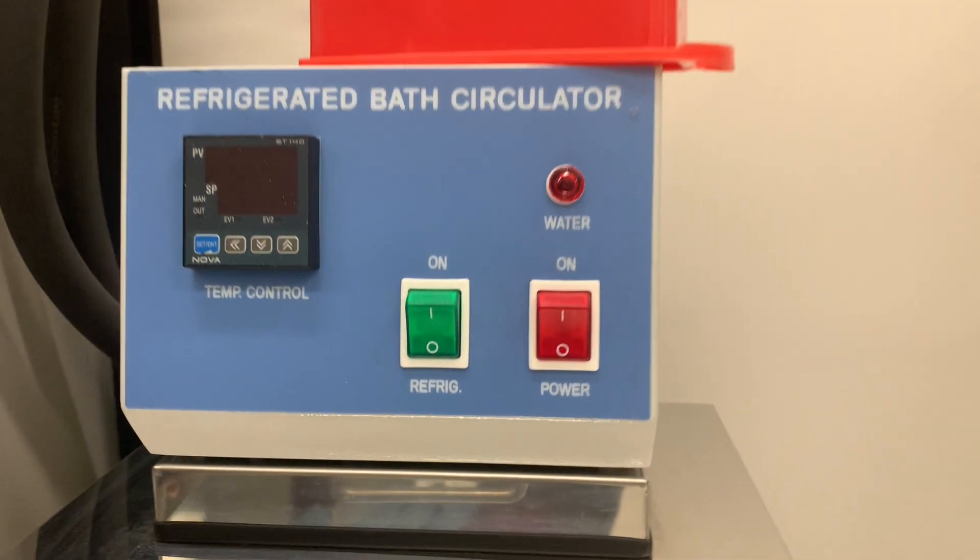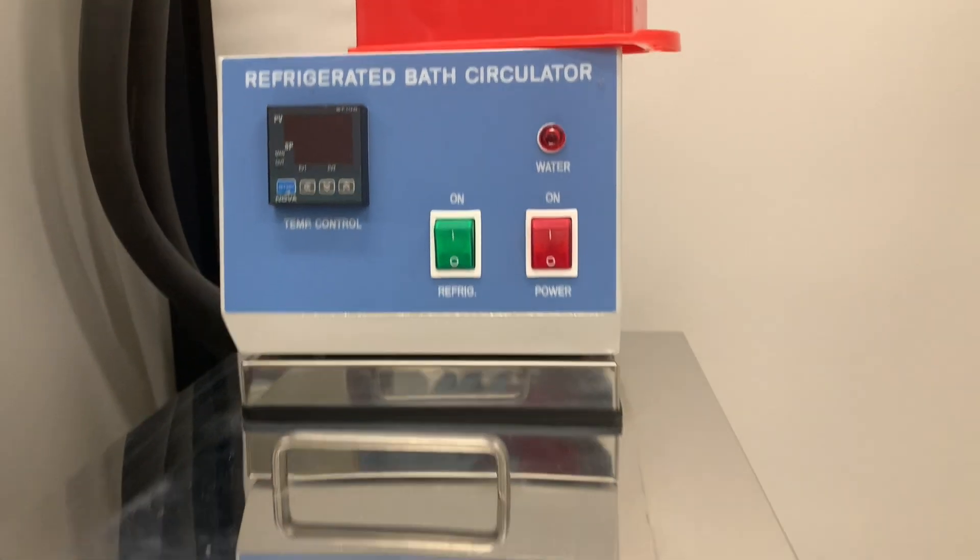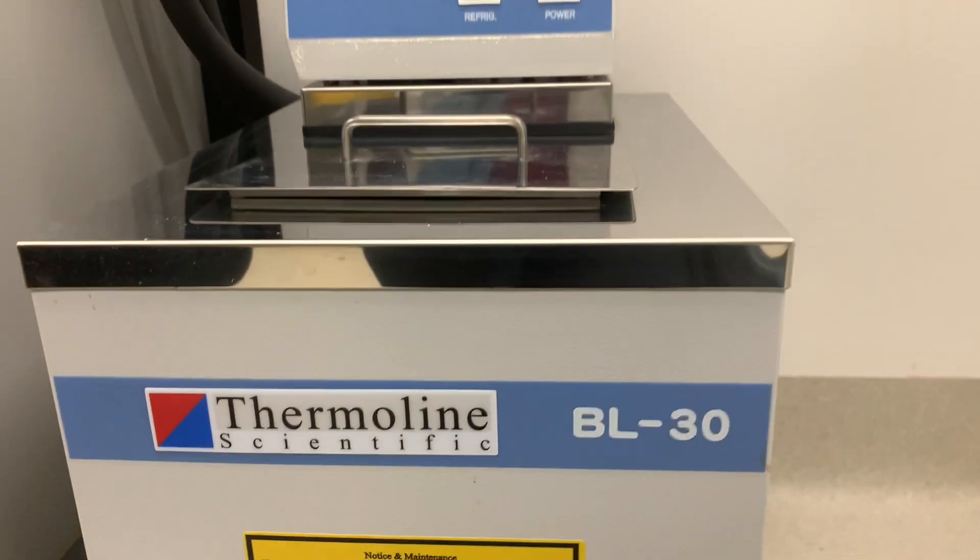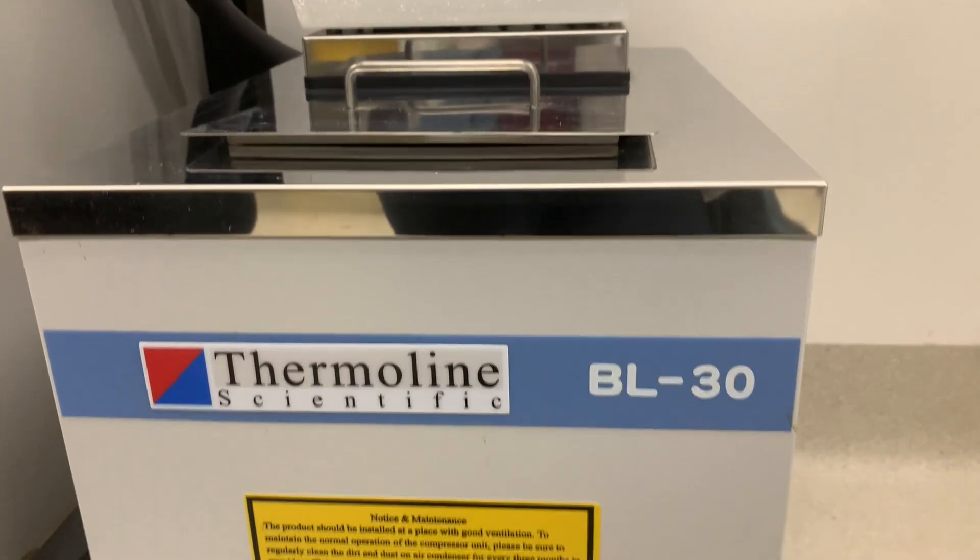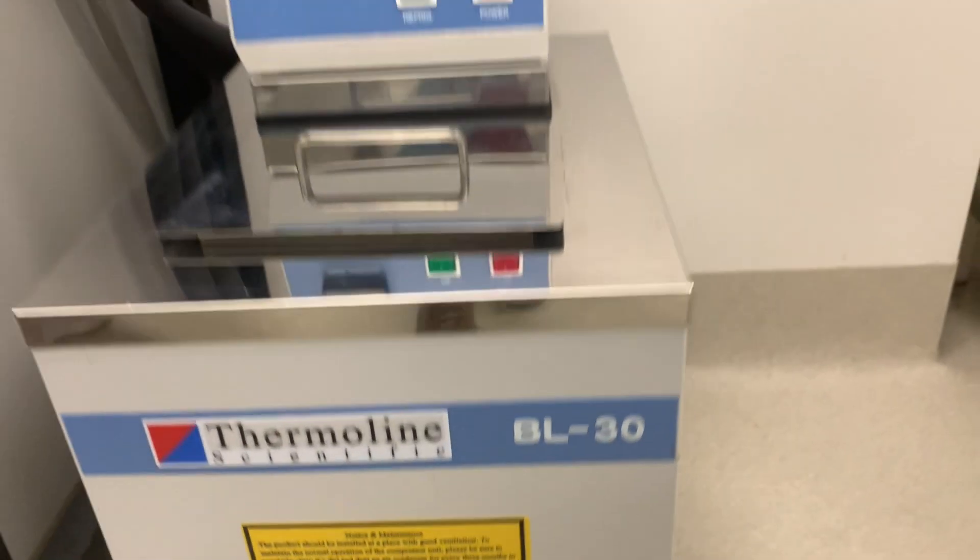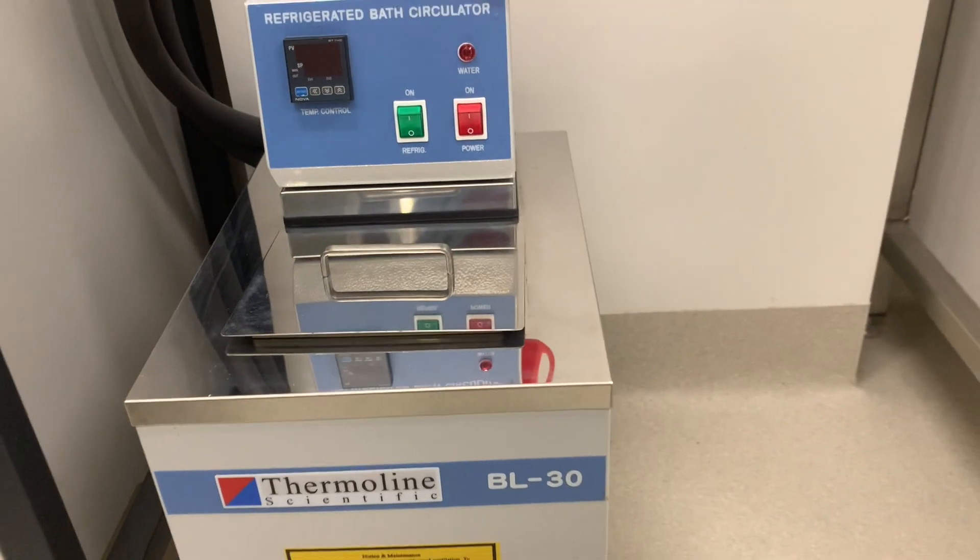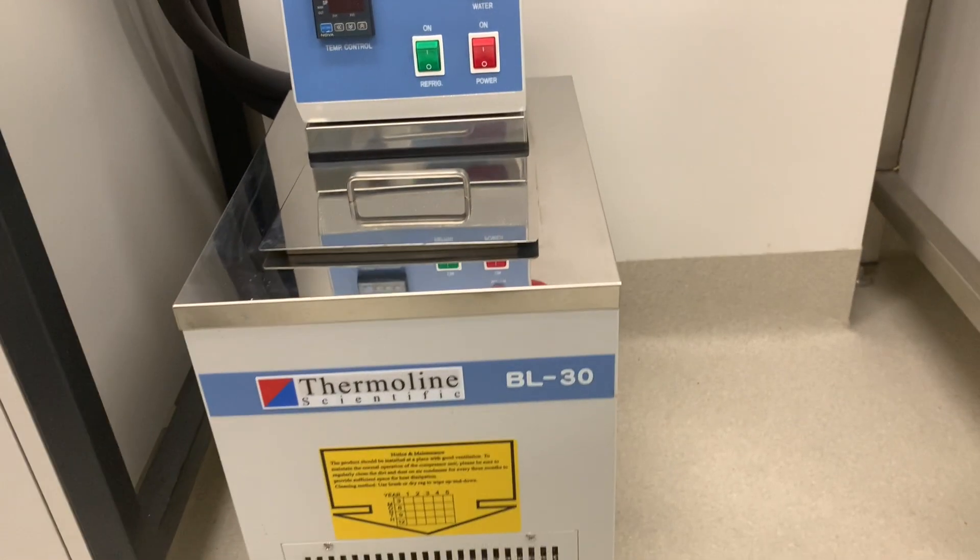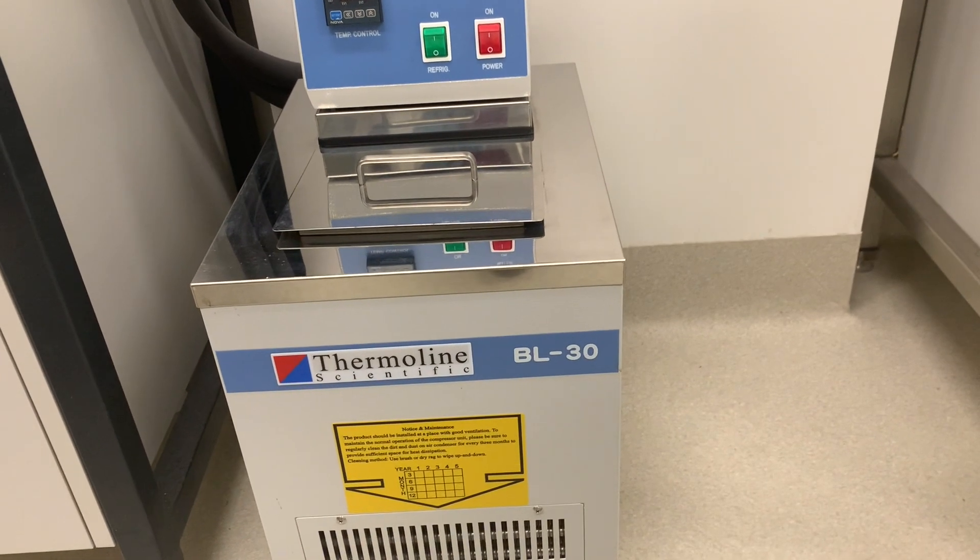Taking a closer look at a real-life fragmentation device, a physical shearing device, you can see here there's a refrigerating component. This is to ensure that you don't overheat your DNA while attempting to fragment it because you're not trying to damage it, you're just trying to accurately shear your DNA.